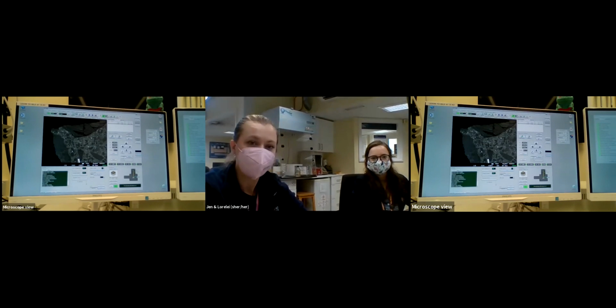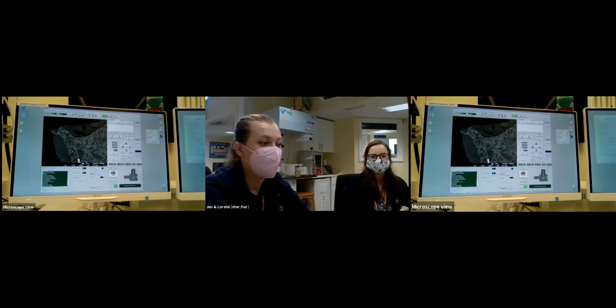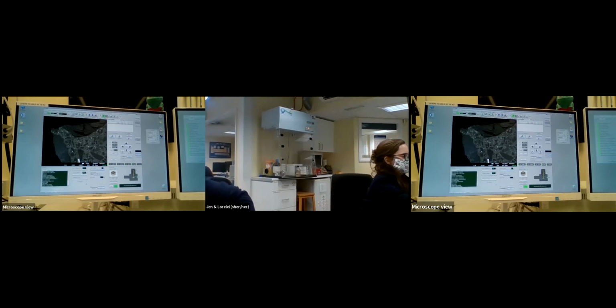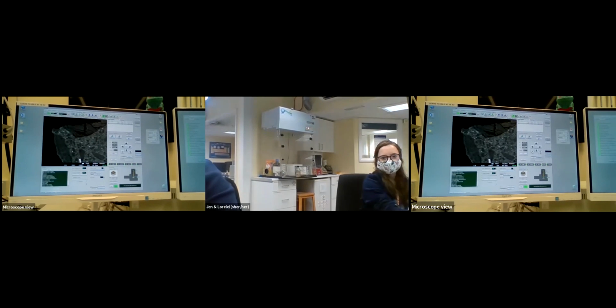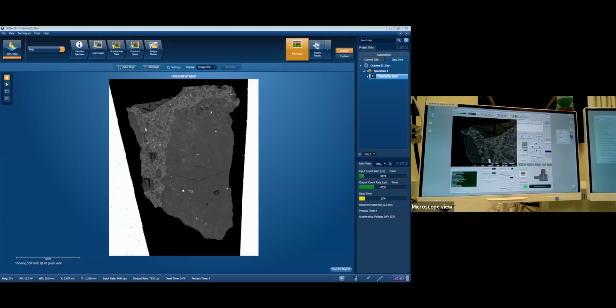So yeah, I think that's the basics. Again, if you do have any questions or want us to explain anything, just let us know. This is going to be pretty casual. We're going to try not to bombard you with too much in-depth science. We're just going to have fun. So what I'm going to do is share the screen that has our software on. There we go, that should pop up.